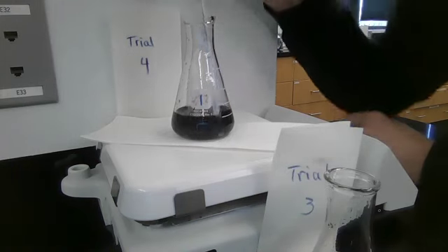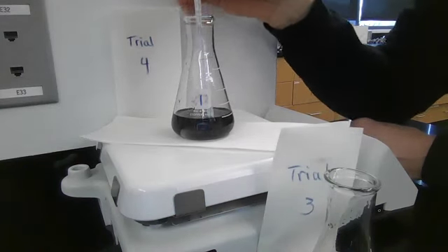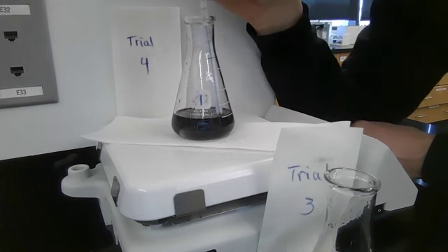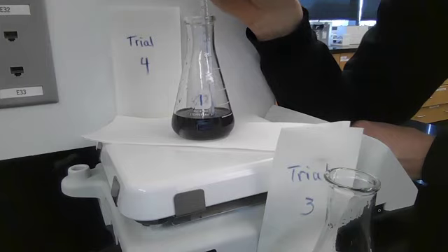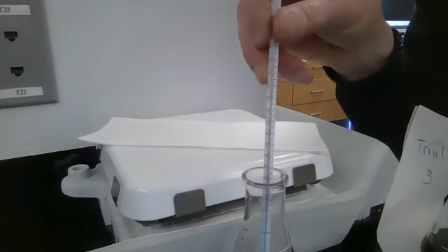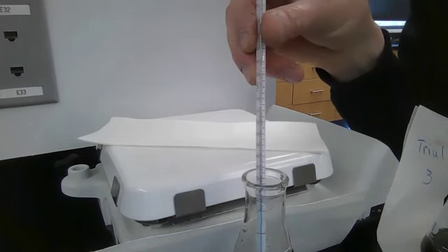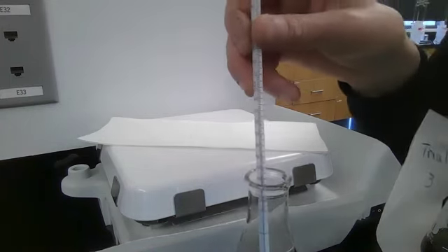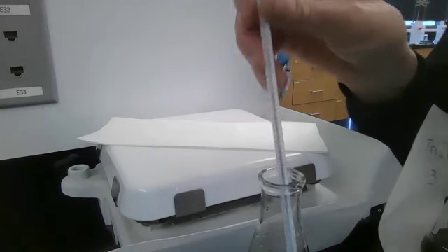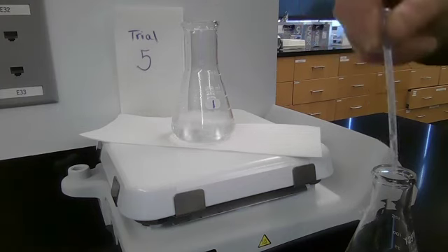We'll shut that off for a second. We need to get that down here. Trial 4's temperature. Even harder to read, right at the top of the Erlenmeyer. This is degrees C. Okie-doke. Not much change.